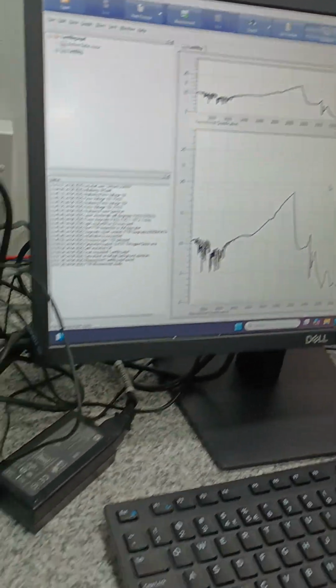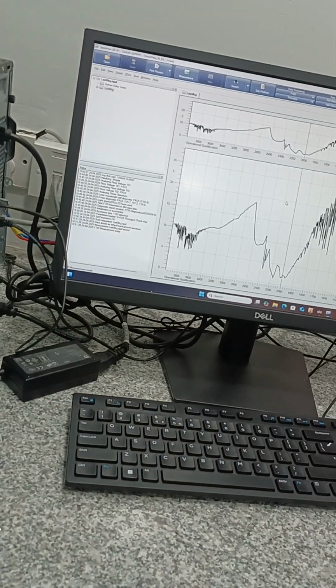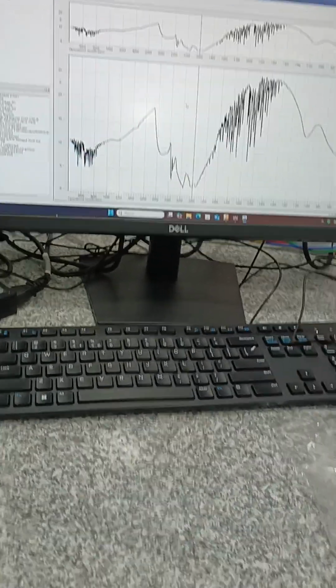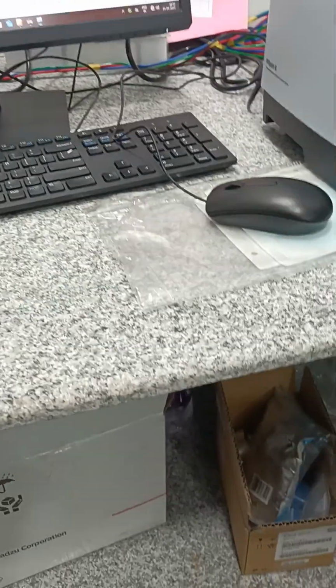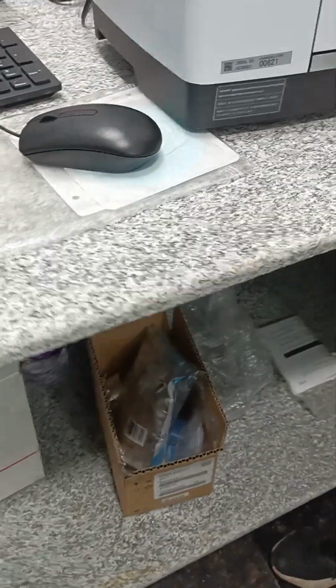These noisy peaks are moisture peaks. They will be there for all models, whether Shimadzu, PerkinElmer or any other instrument. That is common. And how can I identify that if I inject a sample, and understand what result is coming?